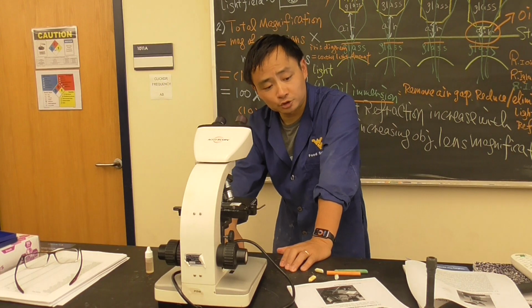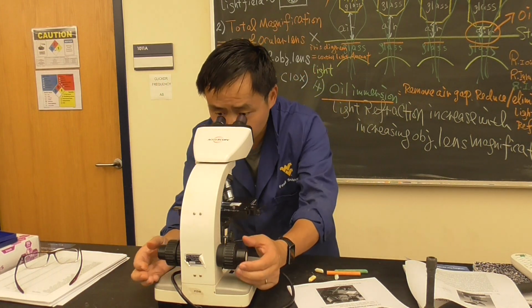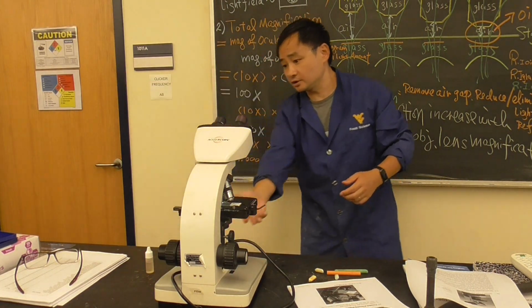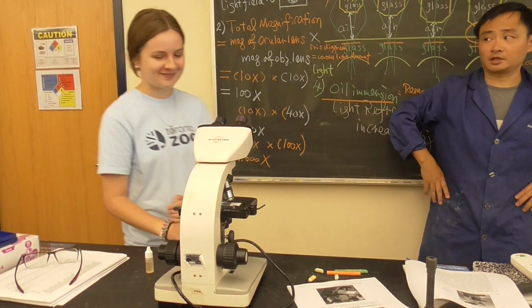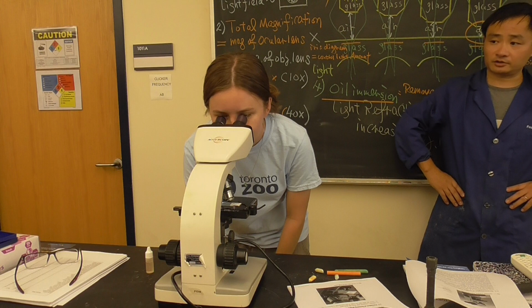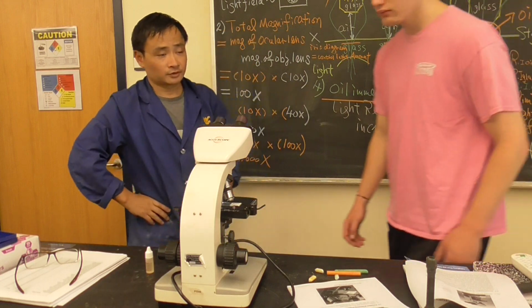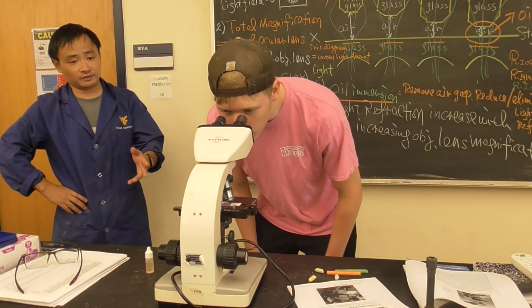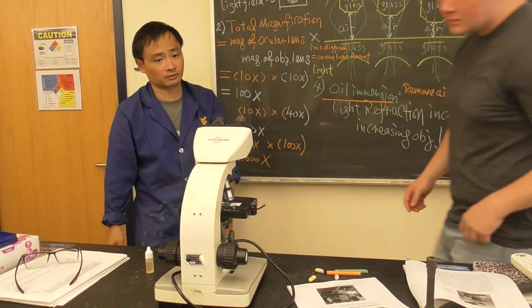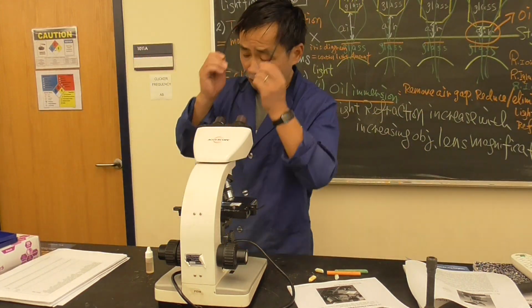But there is one thing I forgot to do. The iris diaphragm needs to be put at 100x. Otherwise, you see it's very dark. So when I put it at 100x, you will see what the specimen looks like. Go on here to see it again. That's what it looks like underneath the 100x. It's more clear, you see the grape shape. Cocci, this is Staphylococcus aureus. Come here to see it. Either one, that's what happened. The morphology is very clear, and the staining, I think, is crystal violet. The purple one right here, can you see it? Okay, so that's what we do.